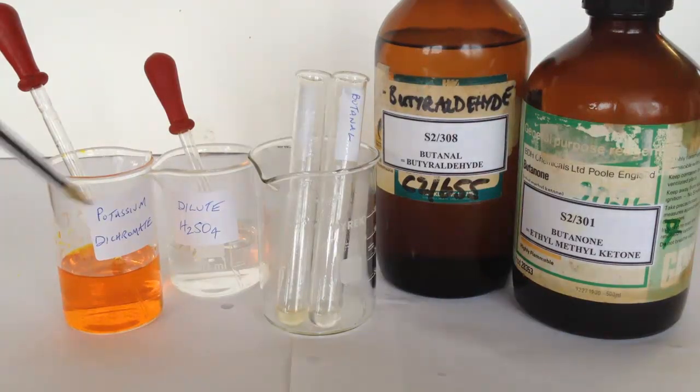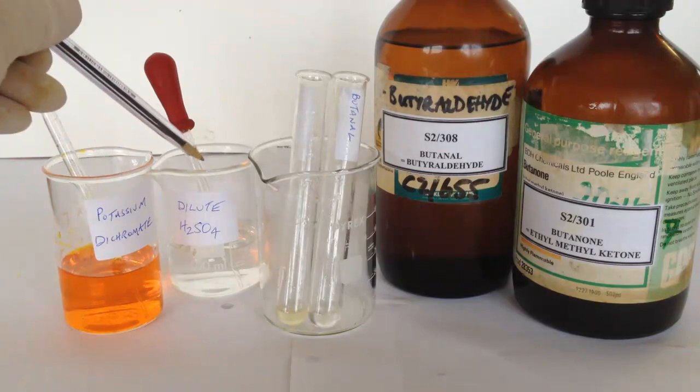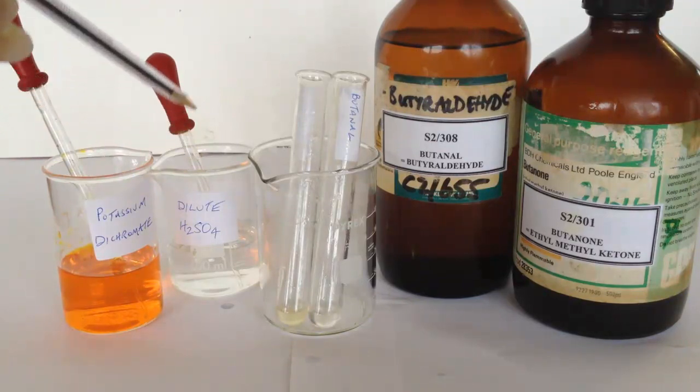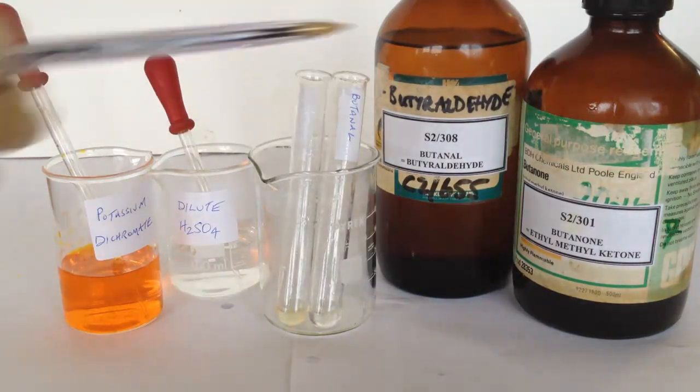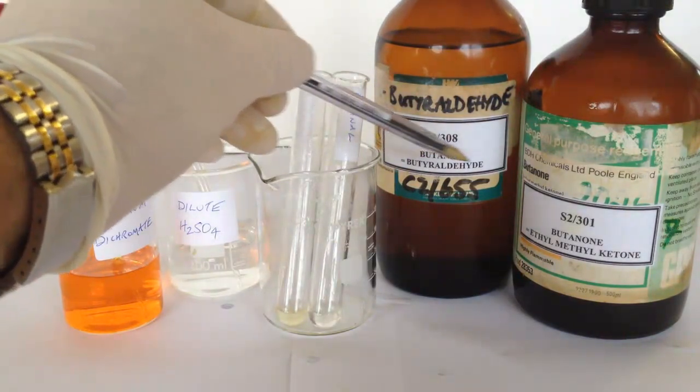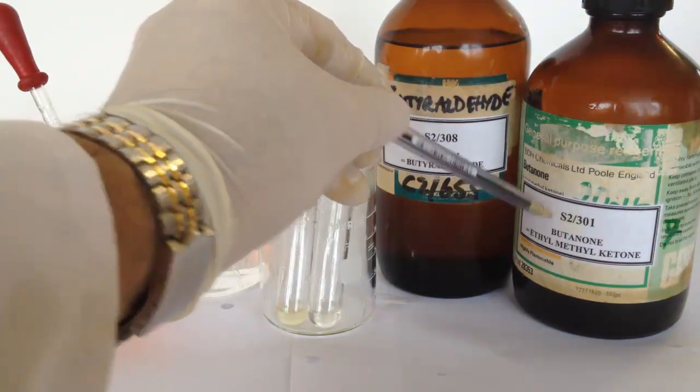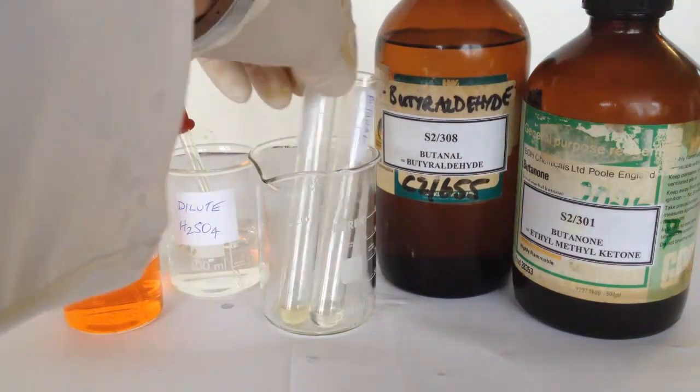In the first beaker I've got an aqueous solution of potassium dichromate, orange in colour, then some dilute sulphuric acid. I've got two test tubes, first labelled butanal and the second labelled butanone.